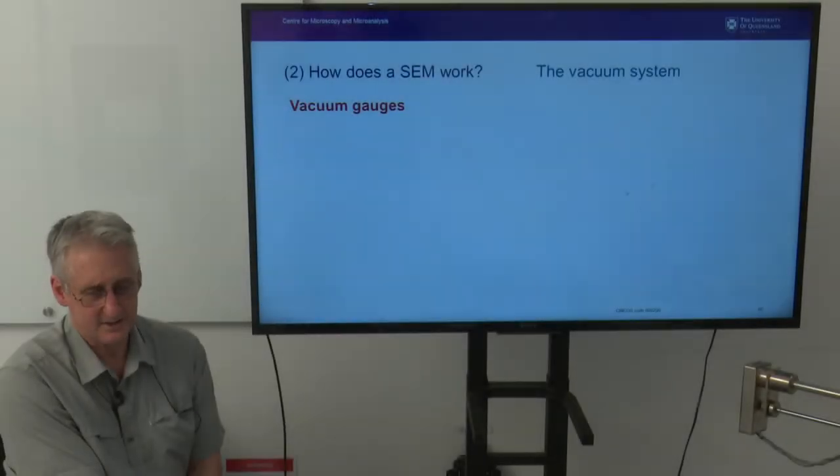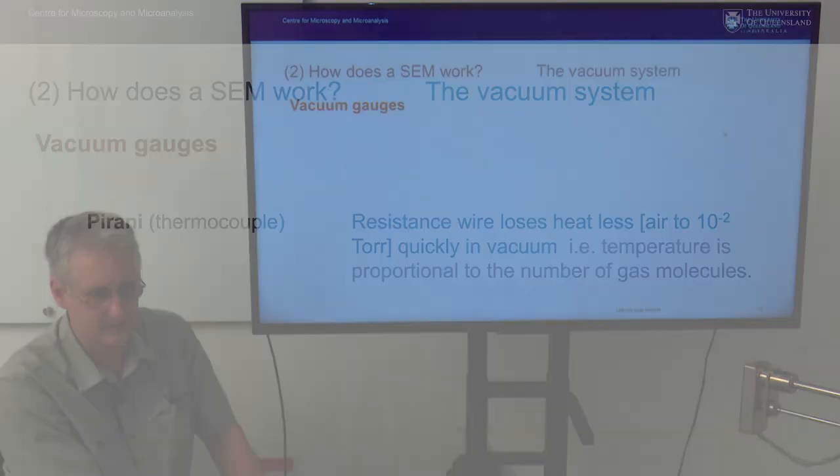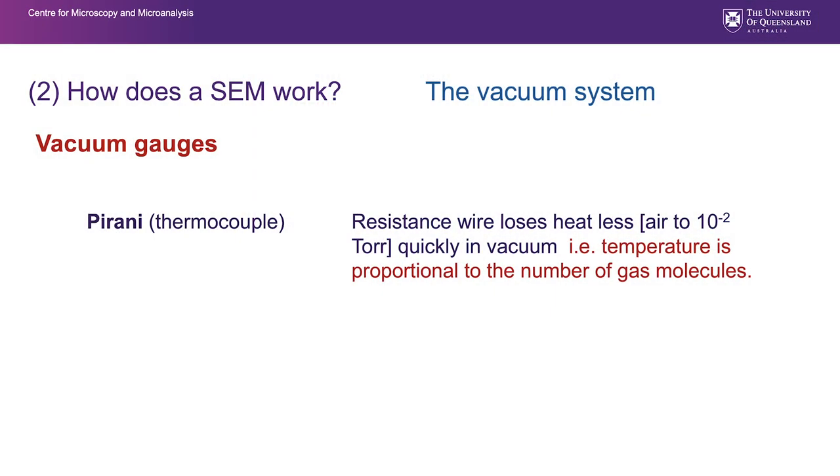There's two gauges that cover the gamut of vacuum for routine scanning electron microscopy. There's a device called a Pirani gauge, and very simplistically it can be described as having a resistance wire that loses heat less quickly in a vacuum. So the better the quality of the vacuum, the less quickly that resistance wire loses heat. And we simply calibrate that temperature to the number of gas molecules, and we can use it to register the quality of vacuum. It measures from air up to about 10 to the minus 2 torr, which is about a roughing pump vacuum.